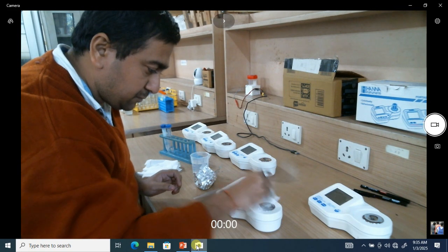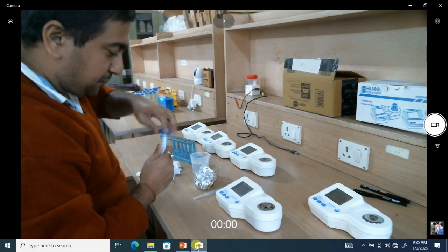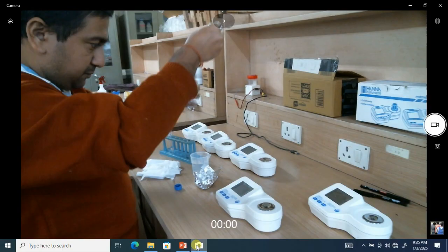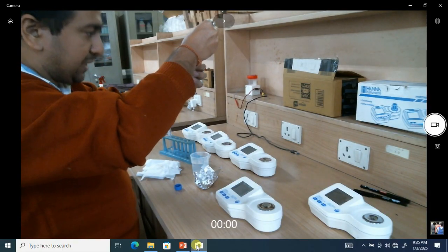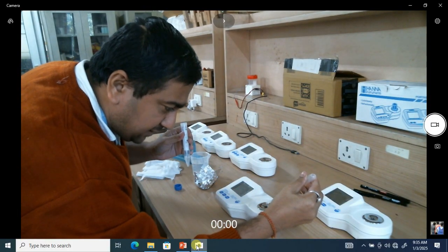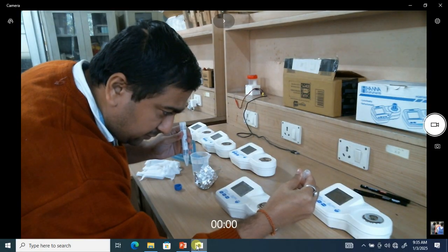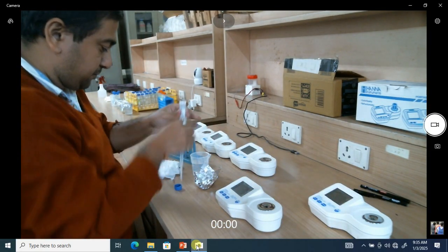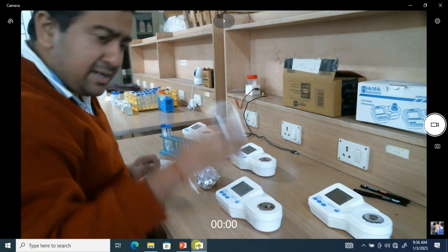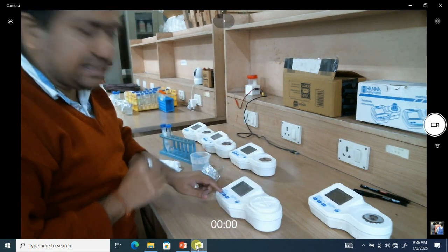So now, let's take this solution which we will test today, and simply take it with the help of a dropper and place it exactly at the center of the prism again. Be very careful, only 1 to 2 drops is enough. Again, we cover this with a cap so that no kind of light interference occurs, and then we'll go for read.